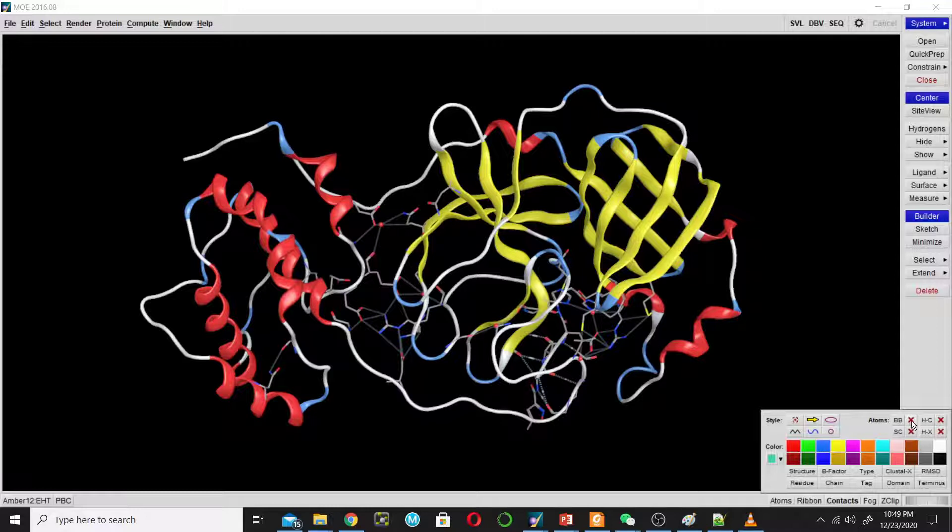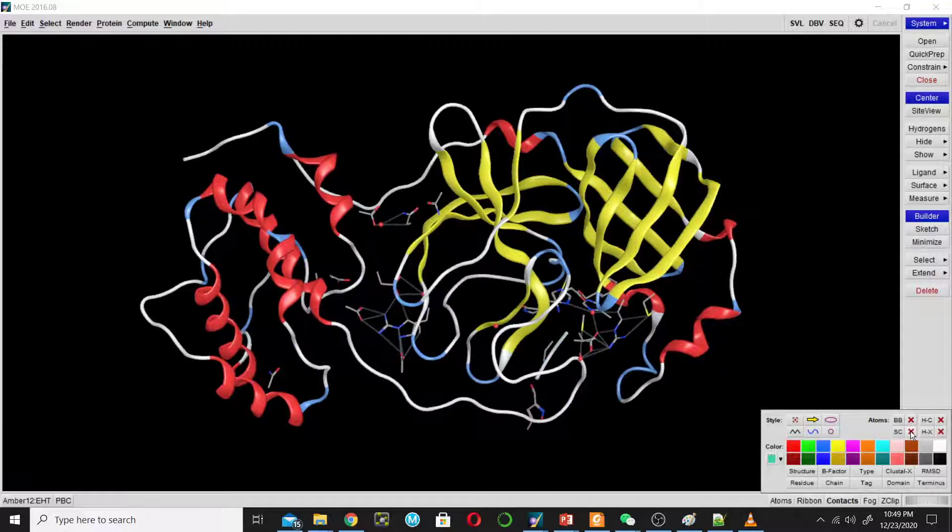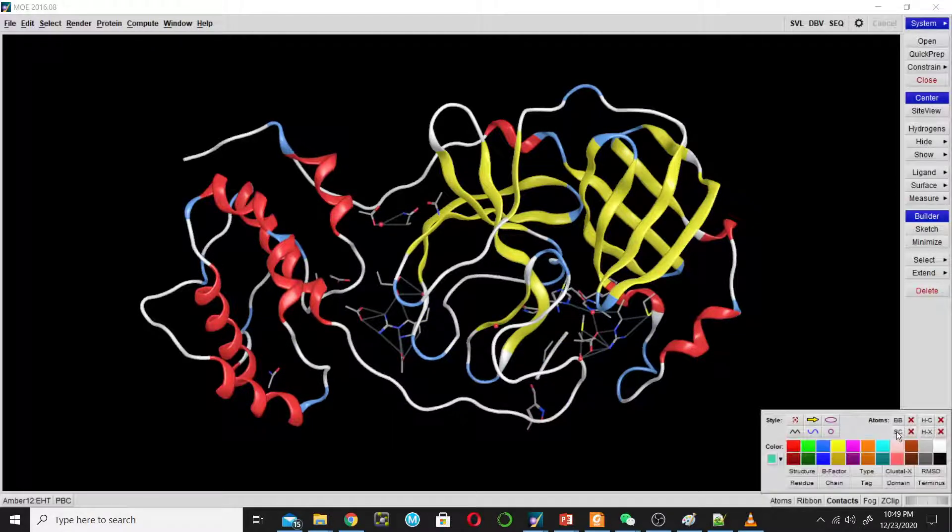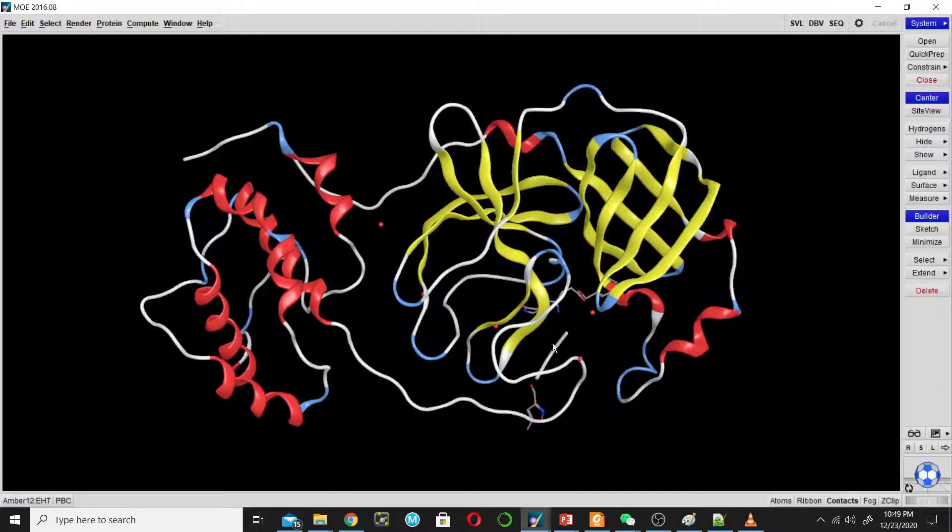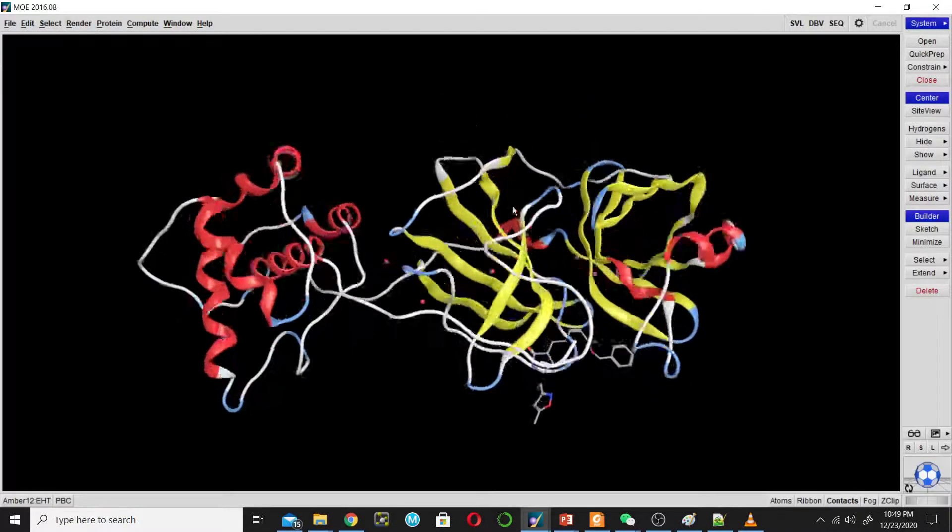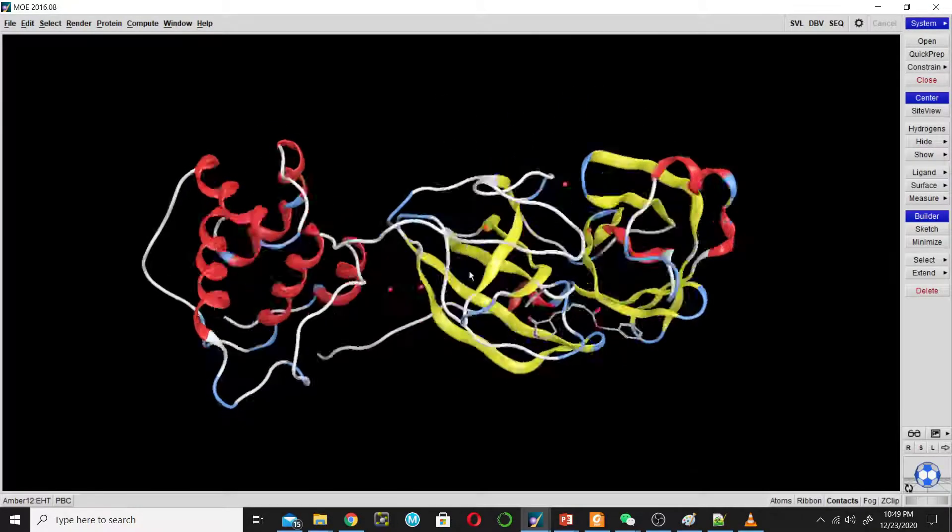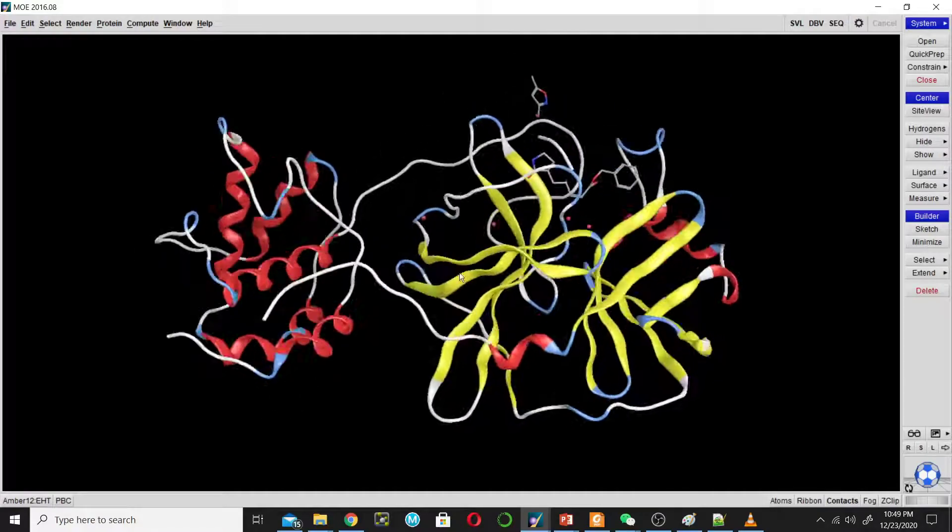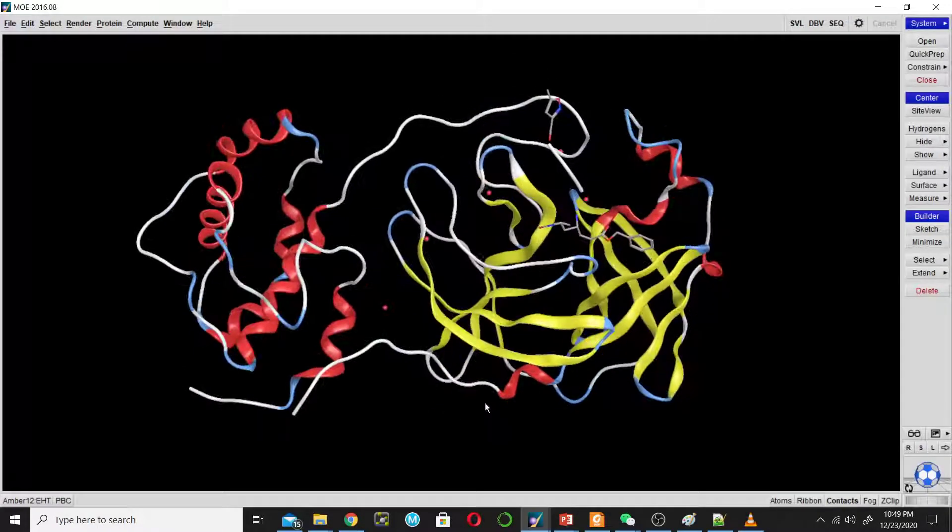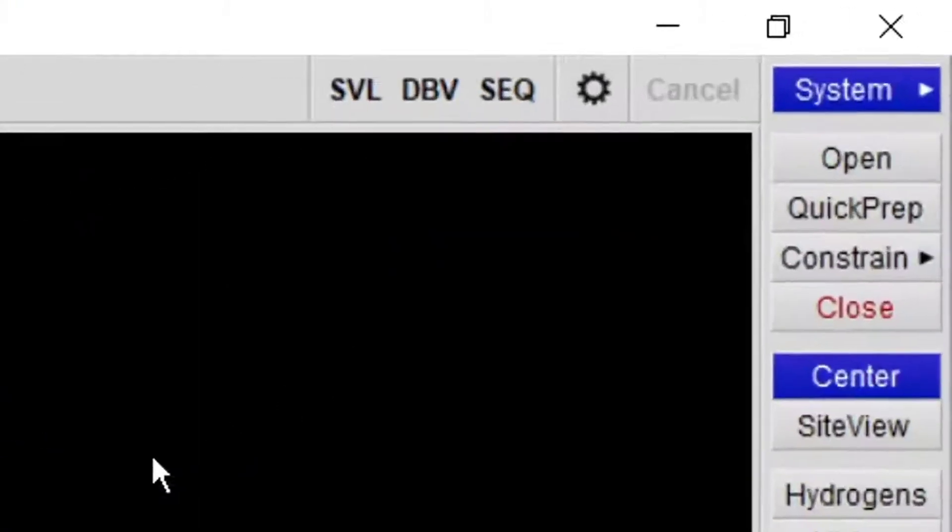Click on this to hide sidechain atoms. Now I have hidden everything. Now go to the sequence and check what's inside this structure.